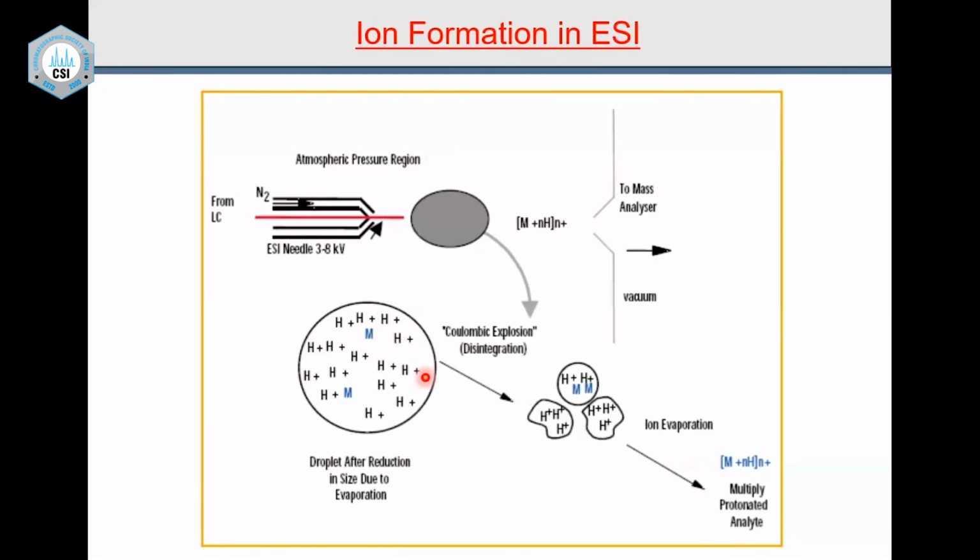And generally in electrospray you get M plus H plus. You must remember that this is the difference between GCMS ionization and LCMS ionization. That is why I said it's important to attend yesterday's session to understand this. In GCMS, what you do is that you remove one electron from the molecule, so you get a molecular ion, which is charged. So there is no mass added to it. It removes one electron, so you get the molecular weight.